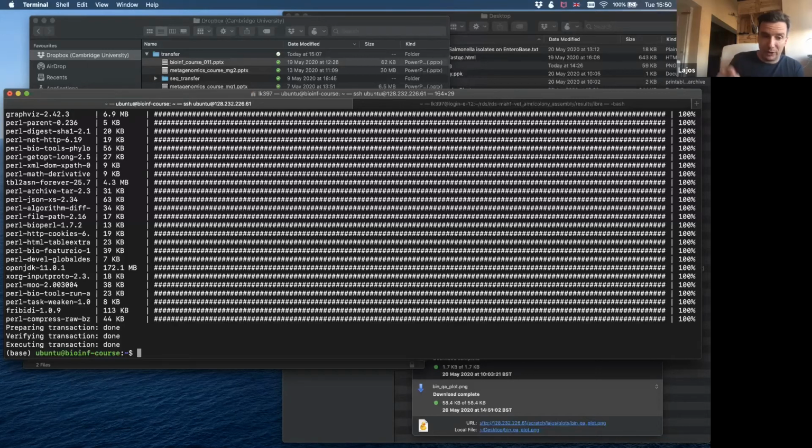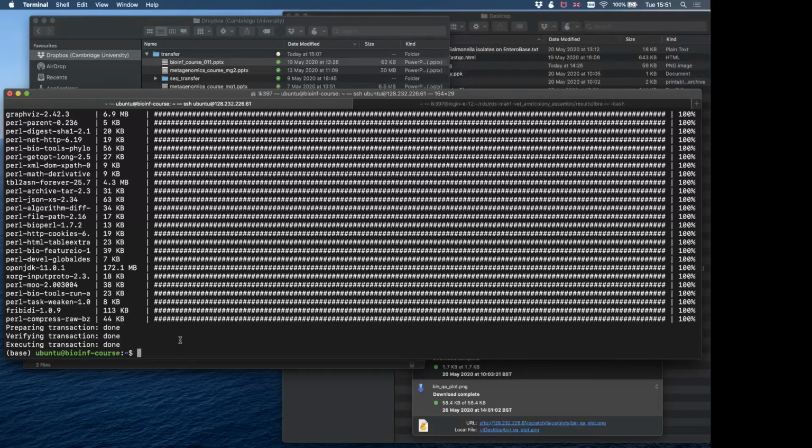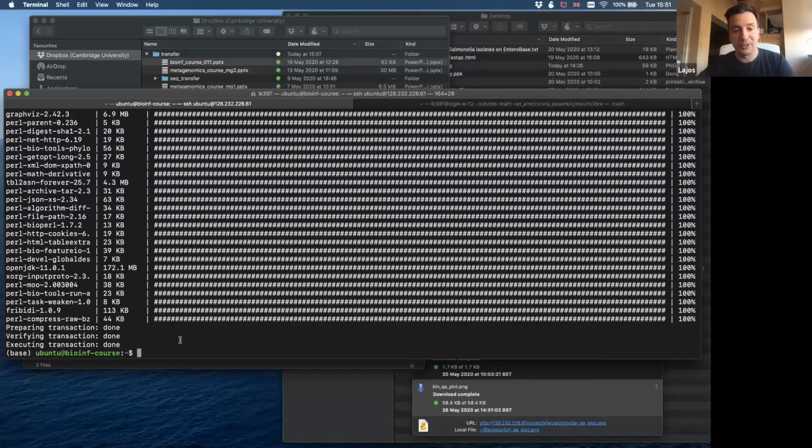And I will tell you the other one as soon as we start our annotation. Did you finish? Yep. Okay, perfect. Because I think the annotation process is maybe a few minutes, so I can just tell the remaining parts of the tale why we are running that. If it's not too long, then everyone else can do it. Let's see how long it is.